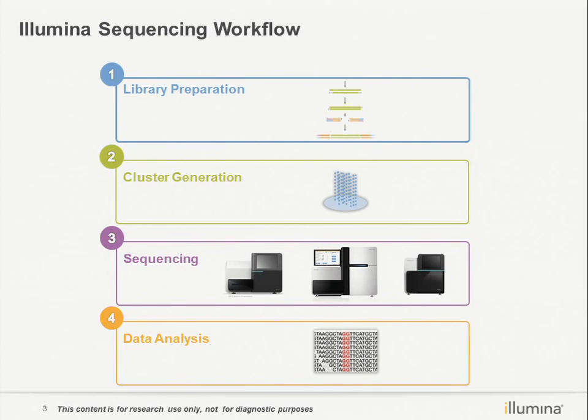A quick review, as introduced from previous slides by Emily. The total workflow of next generation sequencing includes library preparation, cluster generation, sequencing, and data analysis. Step 2 and step 3 can be finished on this machine, so it's kind of an automatic step. And in the analysis step, we provide a family of different software on the base environment. They're very powerful for your data analysis.